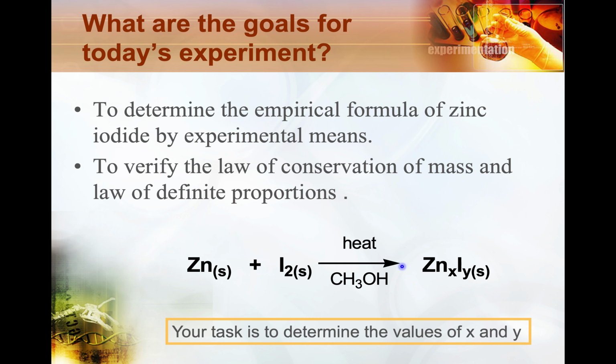The course of this experiment is for you to determine the values of x and the values of y. And these should be consistent across all of you, and these should be whole numbers.